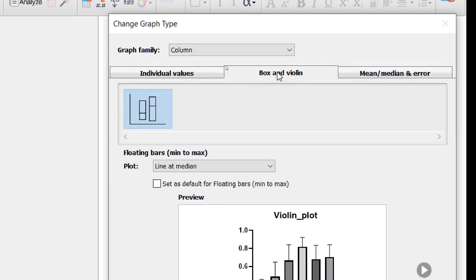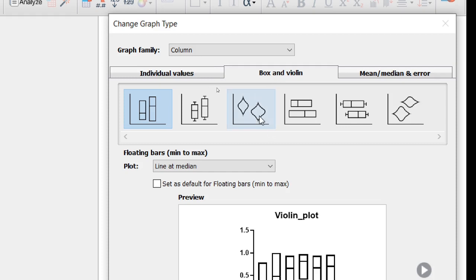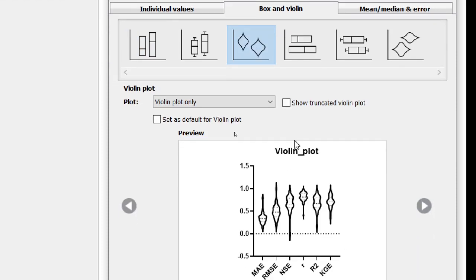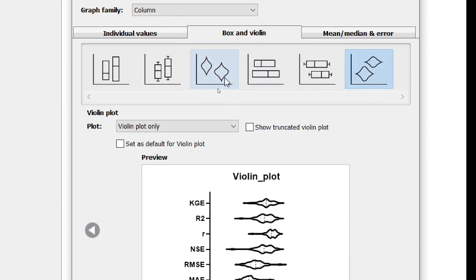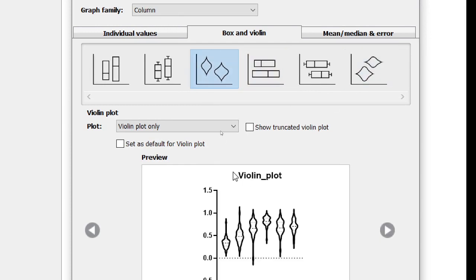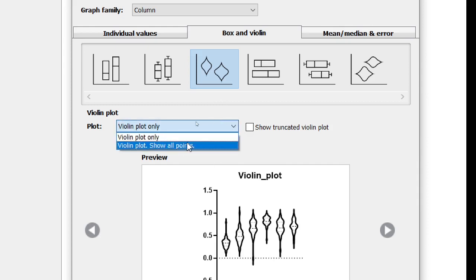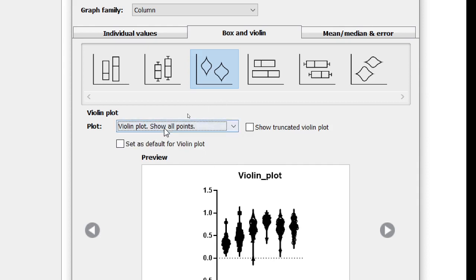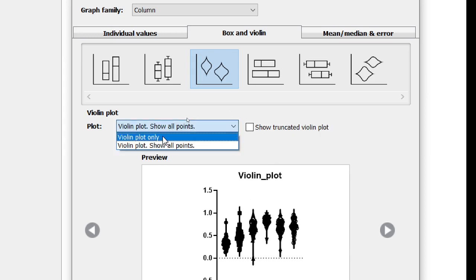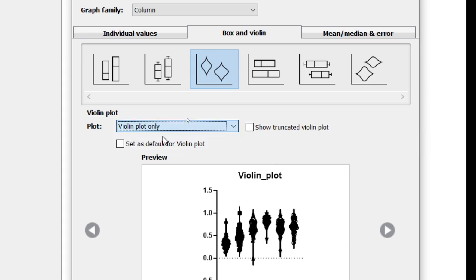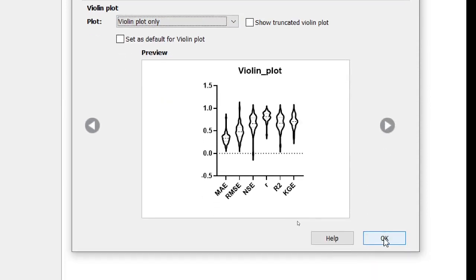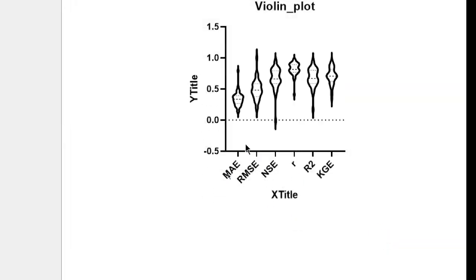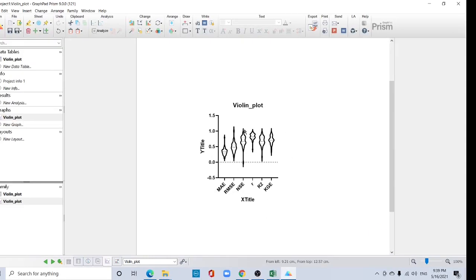Now your graph family must be in column and you should click box and violin. Then you can create this violin. This is a vertical violin, this is a horizontal violin. Now I'm creating this vertical violin. You can also use violin with show all points, also you can use truncated violin. I'll plot violin plot only. Okay, now just okay.